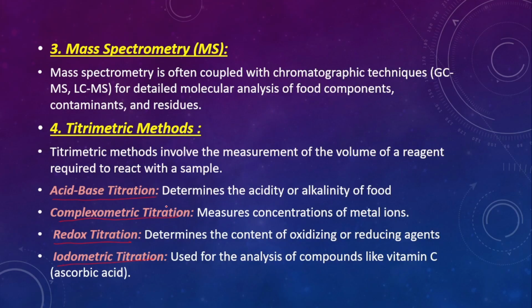The titration curve shows a sharp pH change at the equivalence point, and common examples include the titrations of hydrochloric acid with sodium hydroxide. Acid-base titrations are widely used in laboratories for testing water and food products.